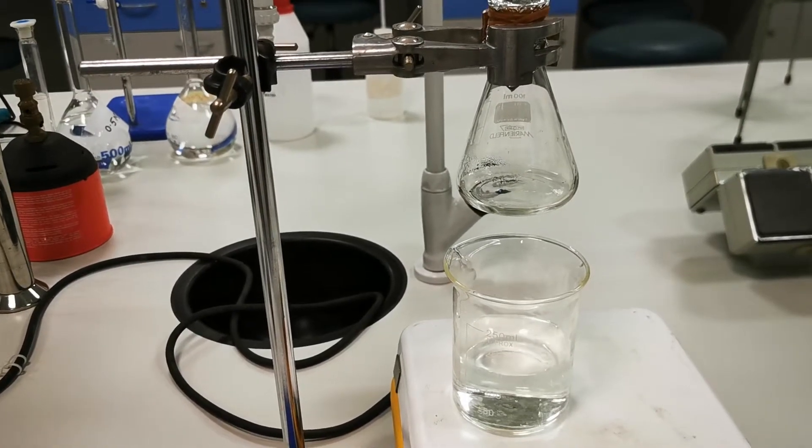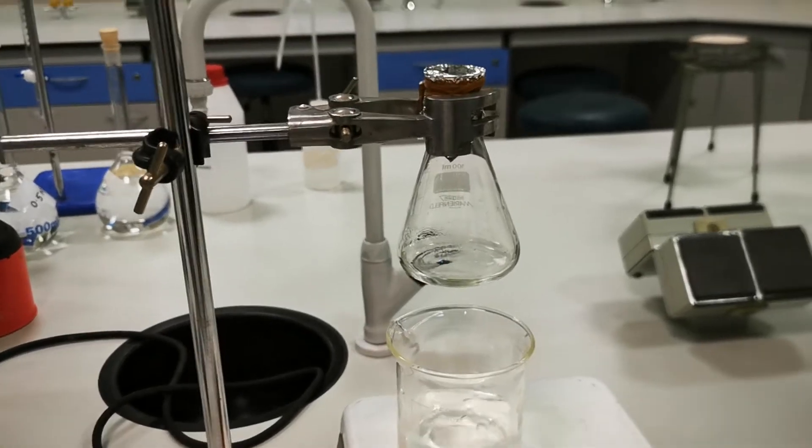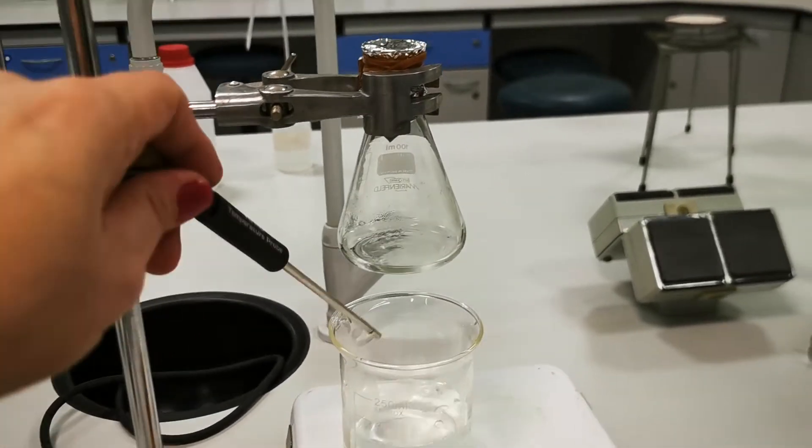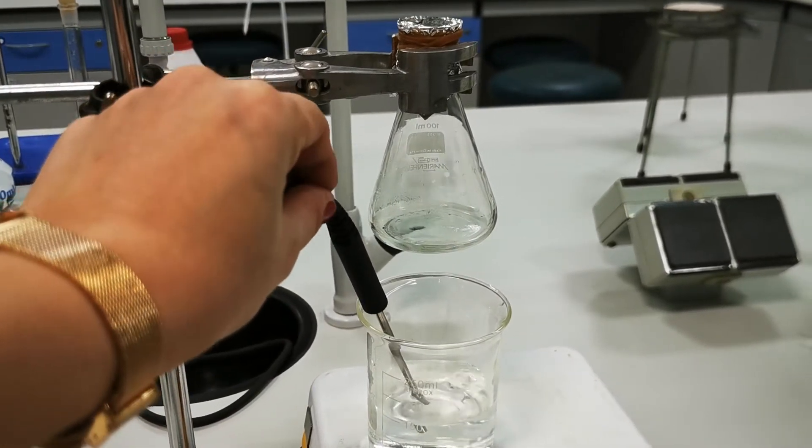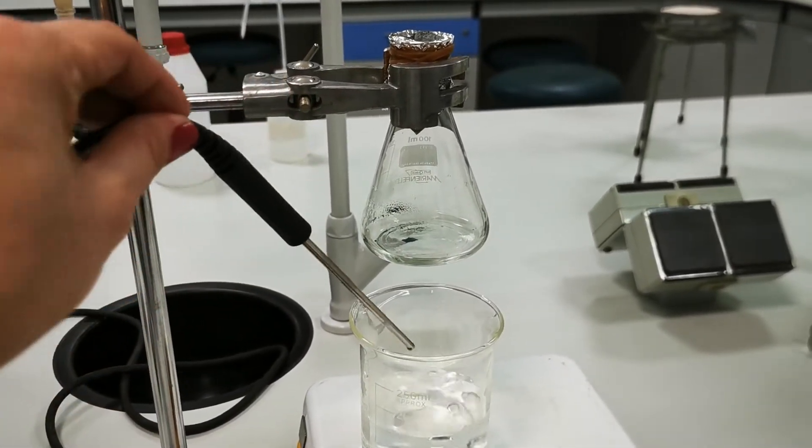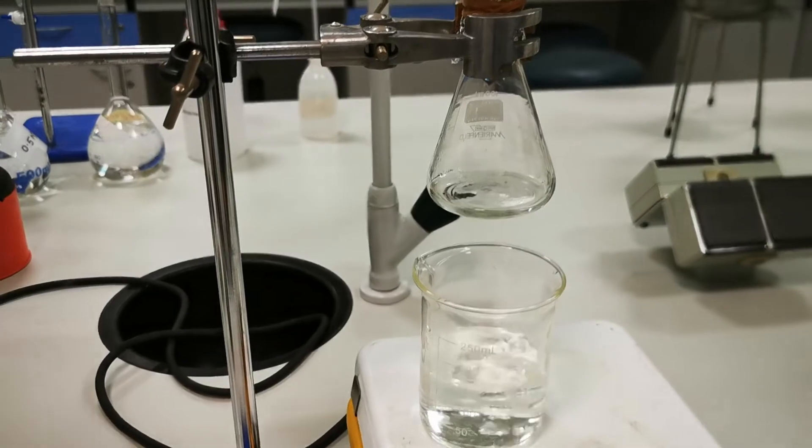So, the temperature... The water started to boil, so it's reaching 100 degrees Celsius. I'm going to now insert the Erlenmeyer flask, containing the volatile liquid, in the boiling water.